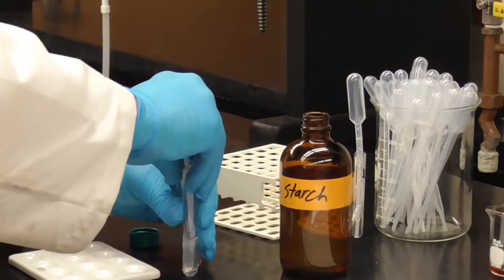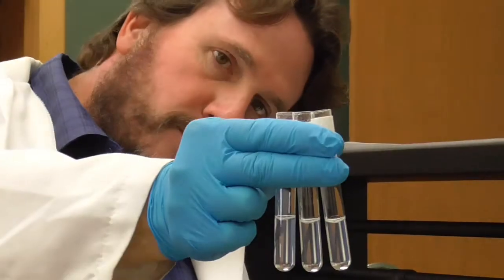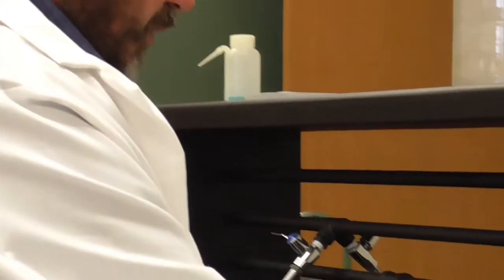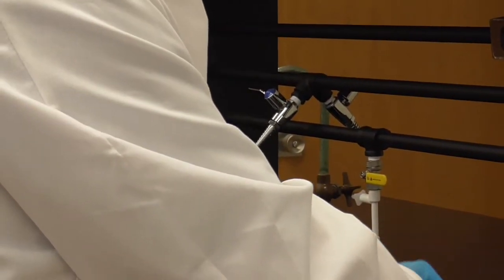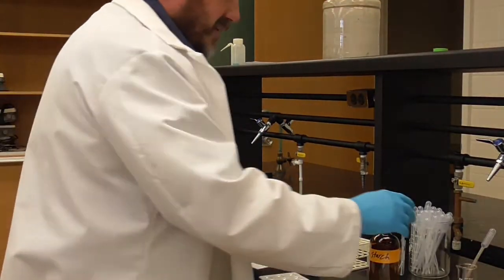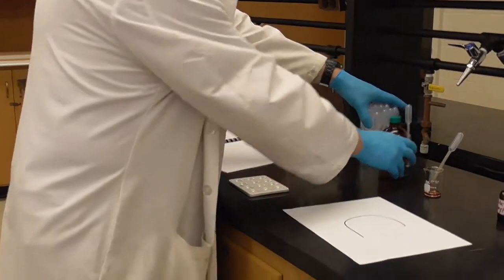Just line those up. And, yep, that looks pretty good. Pretty much the same. Which is what I'm really after here. I just want to be able to compare one test tube to the other, so if I have about the same amount in each test tube, then that'll be comparable. Whether I'm a little above or below 3 milliliters is not as important.